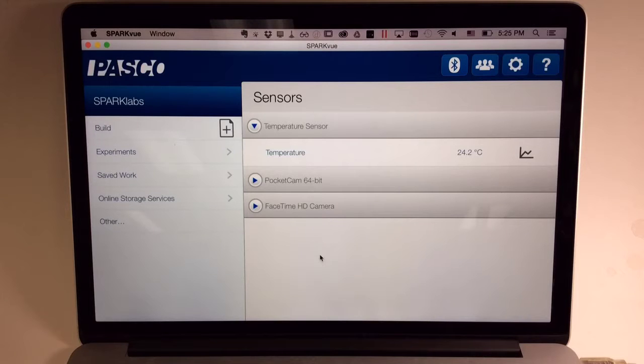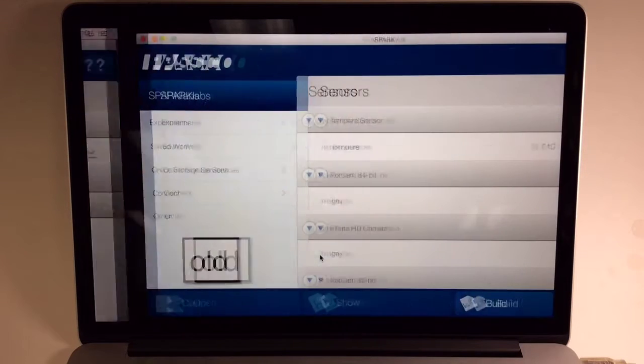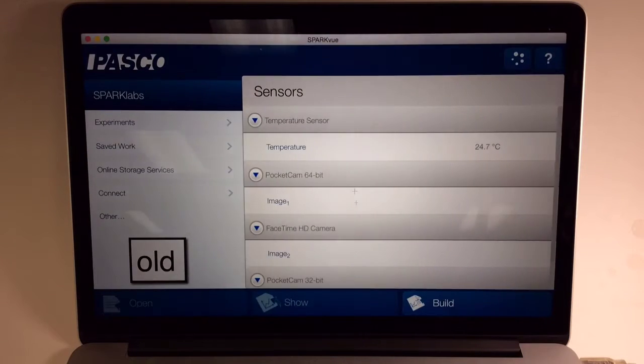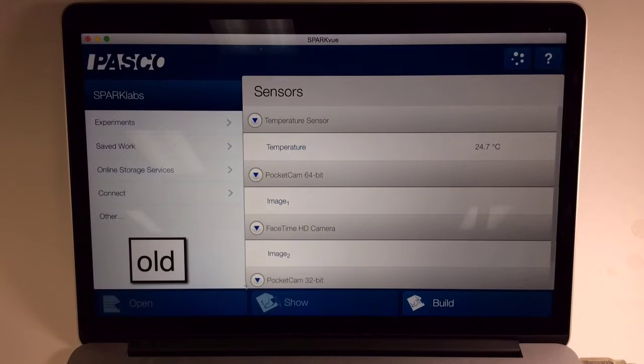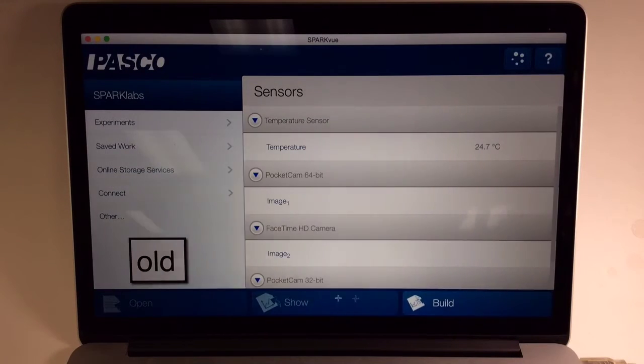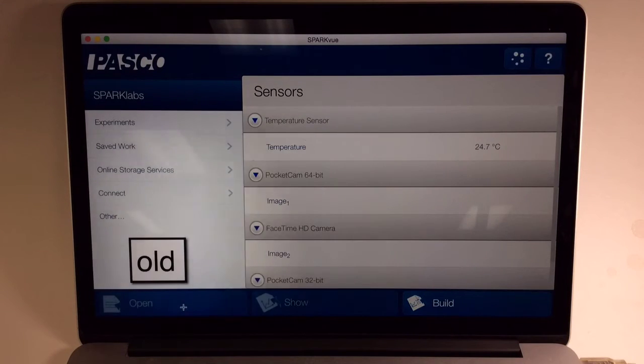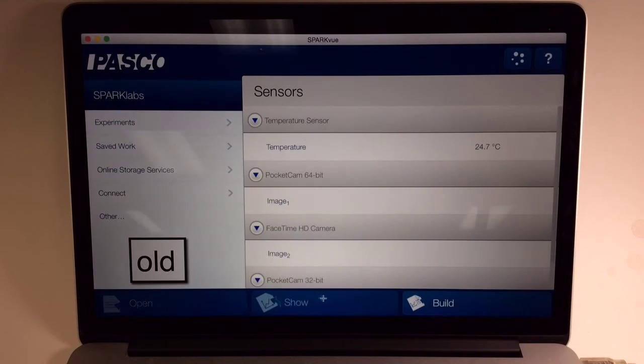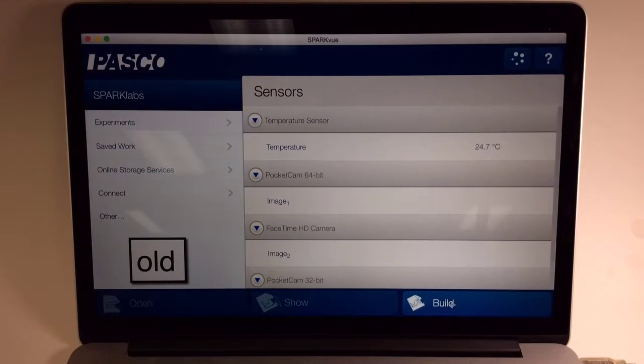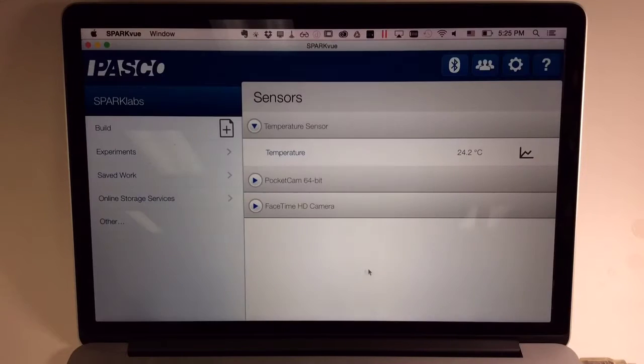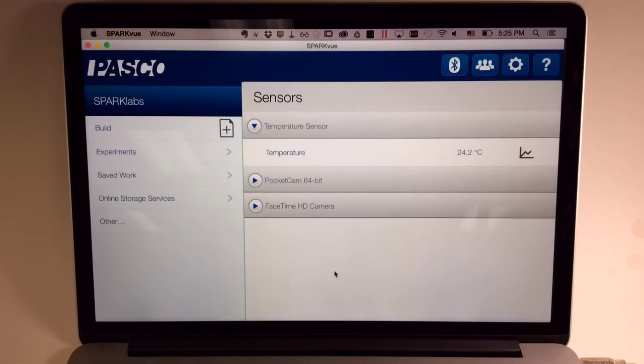How do I navigate the redesigned SparkView home screen? Here you'll see the previous design of the SparkView home screen, and the major visual difference is that the buttons at the bottom of the screen, Open, Show, and Build, are no longer shown in SparkView's new home screen.